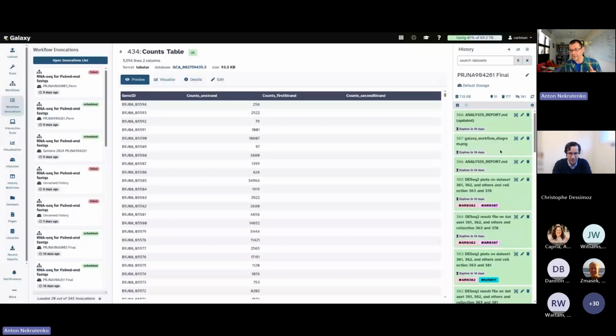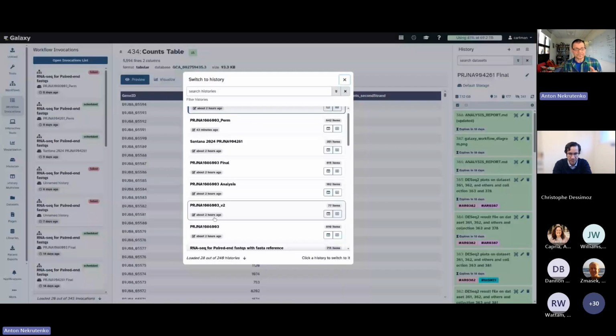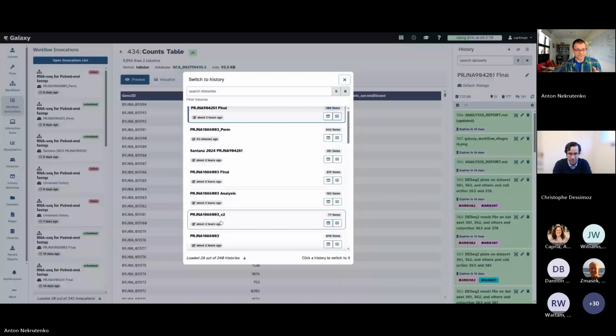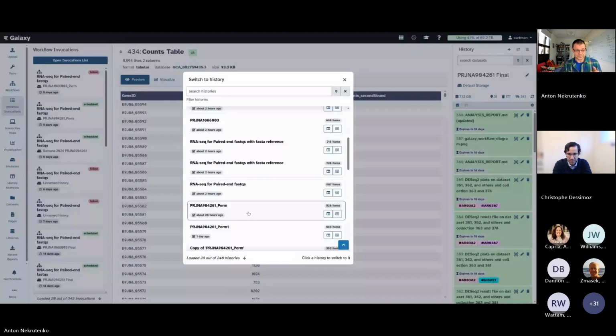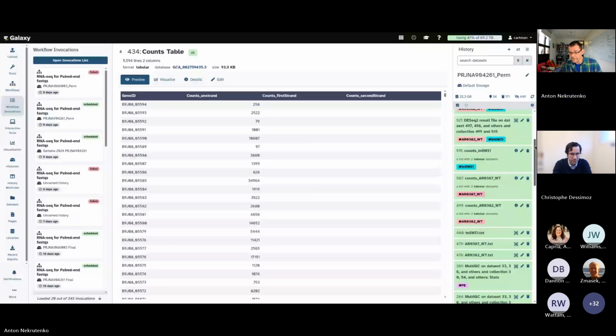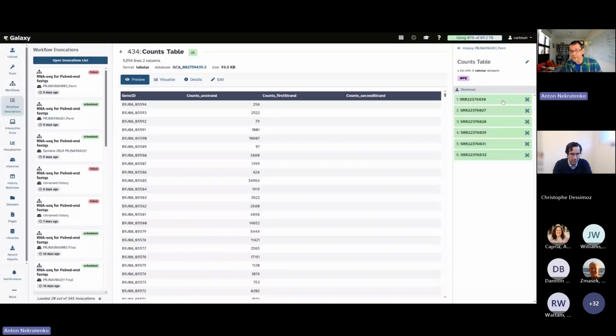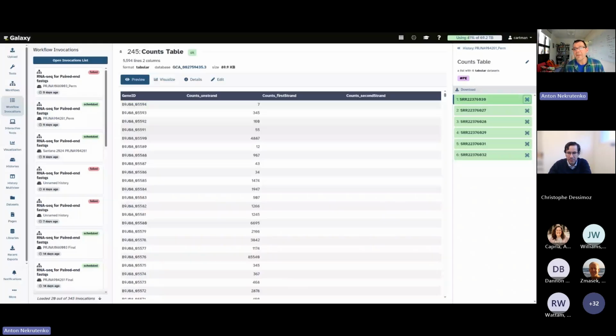Yes, sorry, one second. Okay, this is the right one. So these are the correct counts, because we have 6 samples.